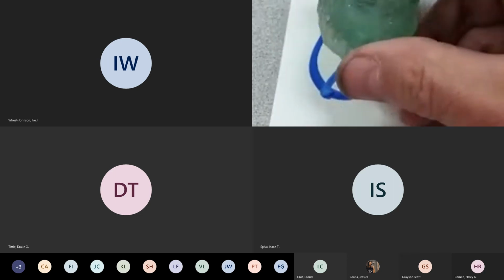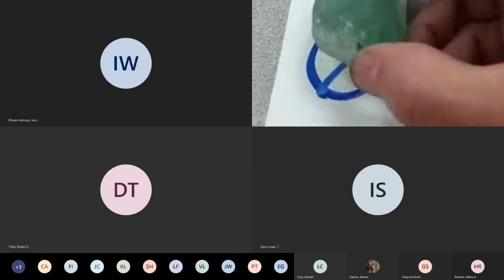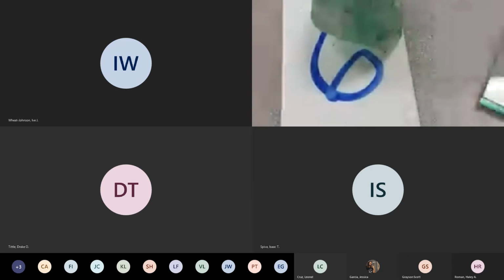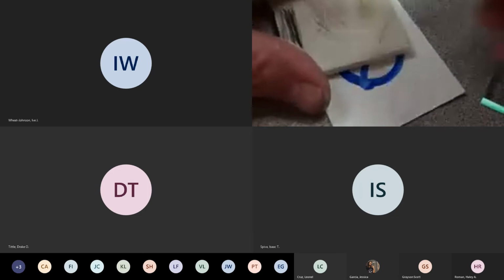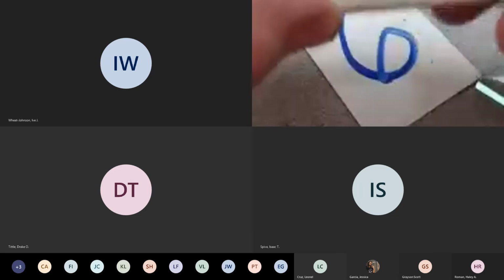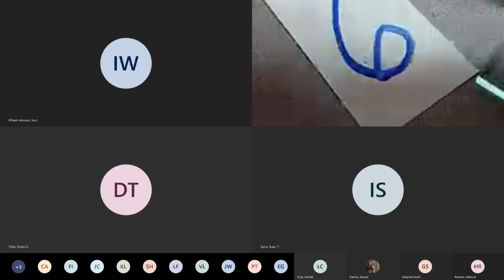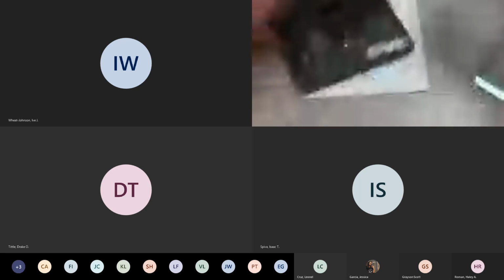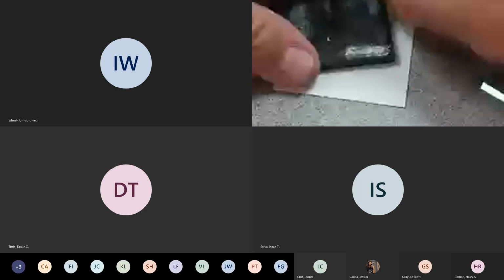So as far as special properties, you might mention that you can somewhat see through it and that it's kind of a distinct shade. So does it leave a streak? So it looks like that's the streak right there at my thumb.